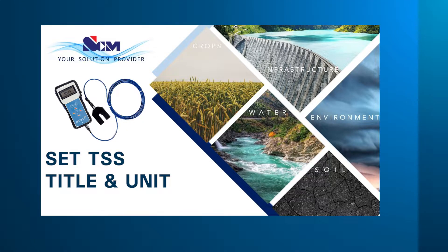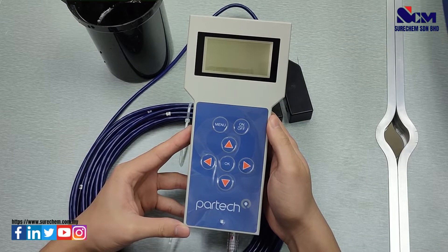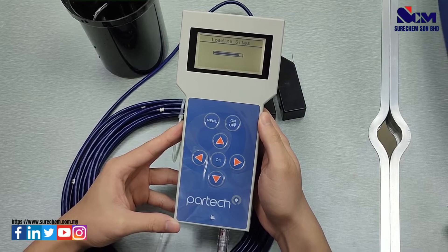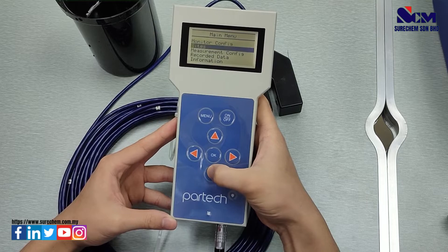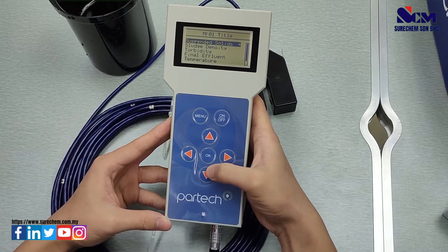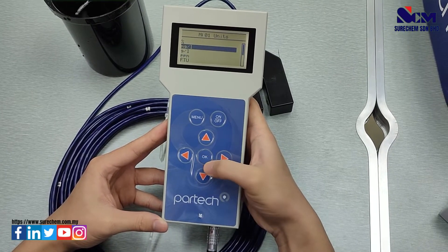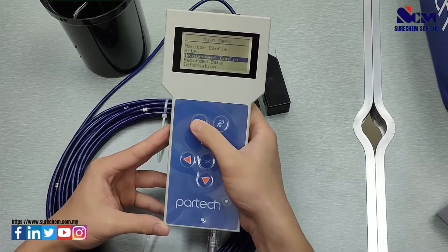Next, how to set the Total Suspended Solids title and unit. First turn on the meter and wait for the meter to load the sites. Select the site, go to Menu, go to Measurement Configuration, go to Title, and select Suspended Solids. Then go to Unit and select milligrams per liter. The correct title and unit will be shown in the menu.